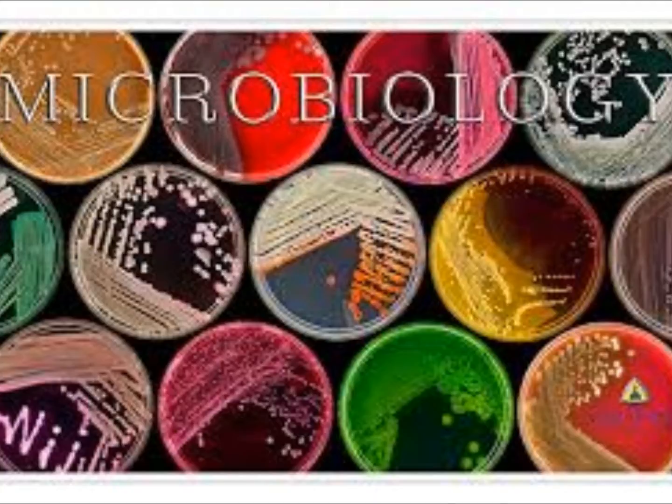Each of you has an organism at your table. You're going to get a slide, and I want you to label your slide, once again, with name, date, and your initials, so that if we don't look at them until tomorrow, we know whose is whose. Then we're going to add a drop of saline to the slide.